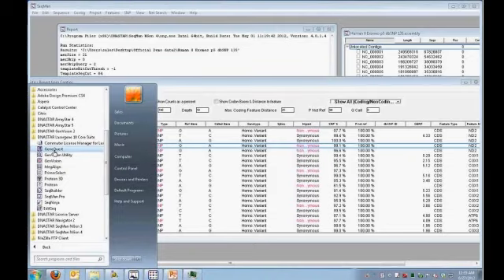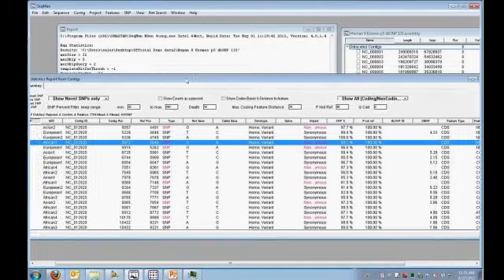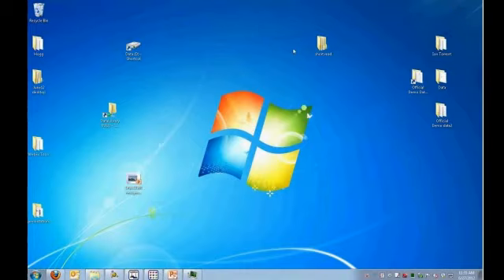This is a 32-bit program. You do not have to have a 64-bit operating system to run it. And again, you may have access to this software. It's been available for quite some time, so your institute may already have SeqMan. So the idea is that for existing customers, at least, if you have Lasergene Core and you're moving into next-gen, you can purchase a SeqMan engine to assemble your data and then get an output that you can analyze in your SeqMan software.